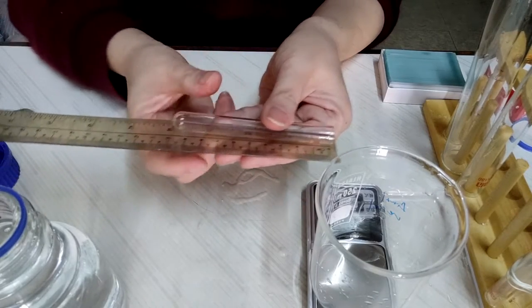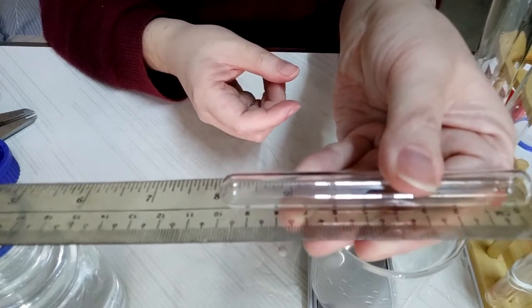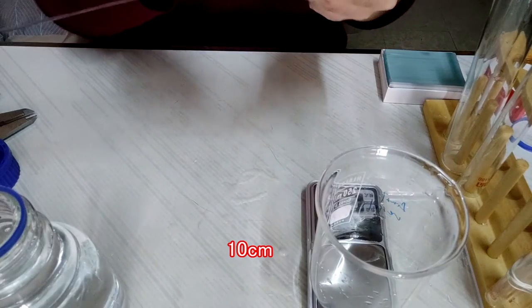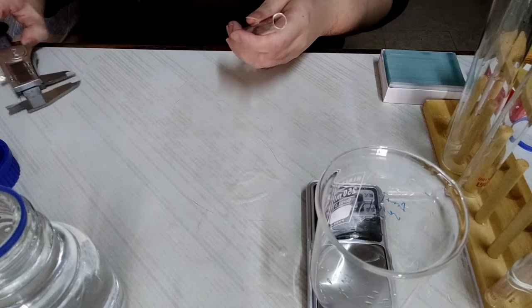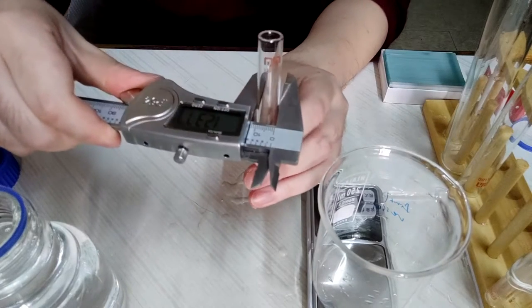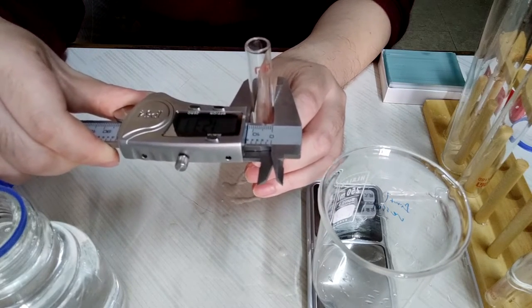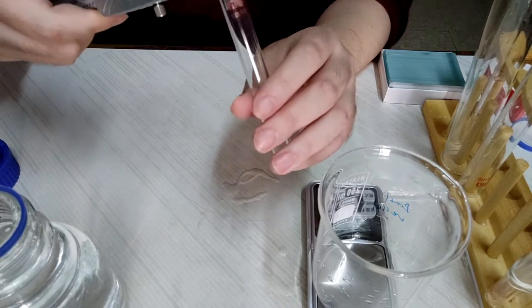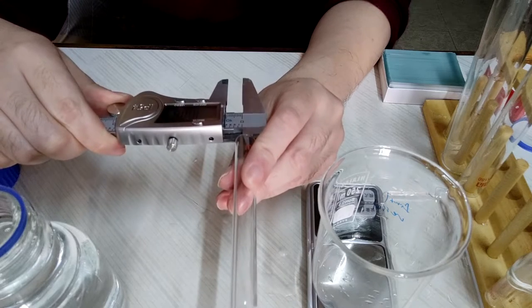The very small test tube has a length of only 10 centimeters, external diameter 12 millimeters, internal diameter 1 centimeter.